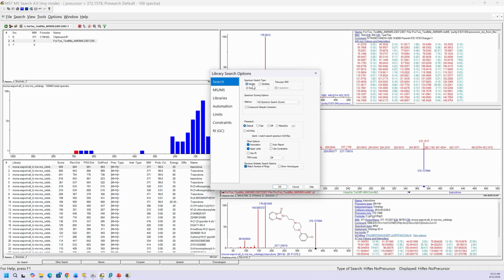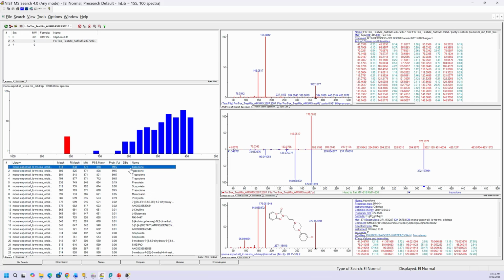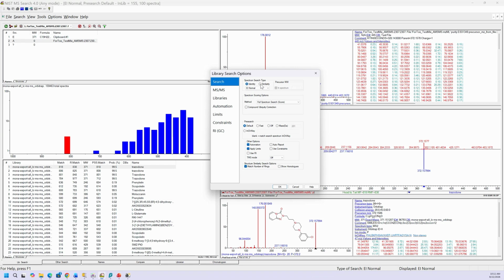If you're on an MSD and you brought it in from in-source where you didn't have accurate mass, this is very useful. So we'll try it to make sure it works. Again, double left click or go, and that worked again. Okay, very good results.